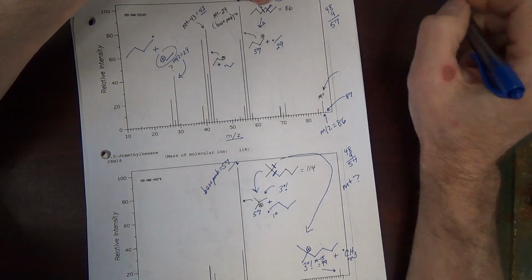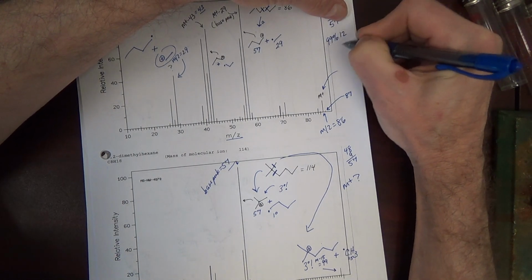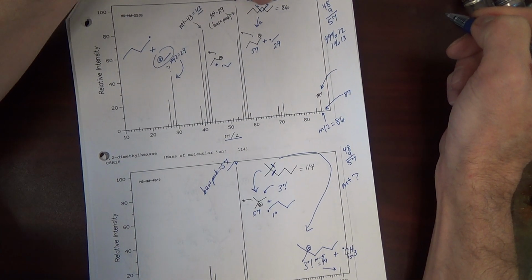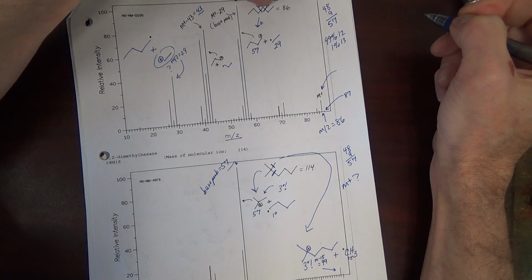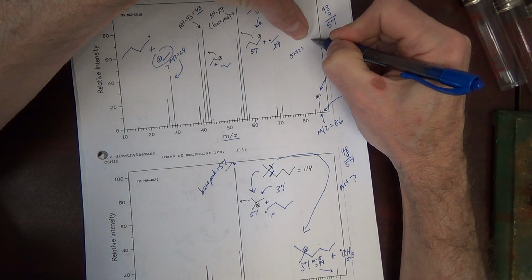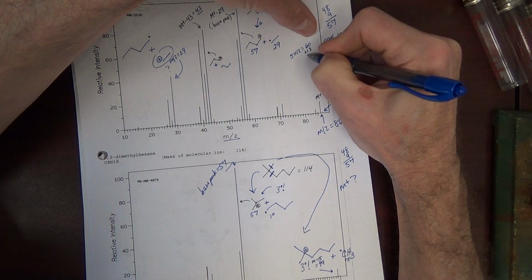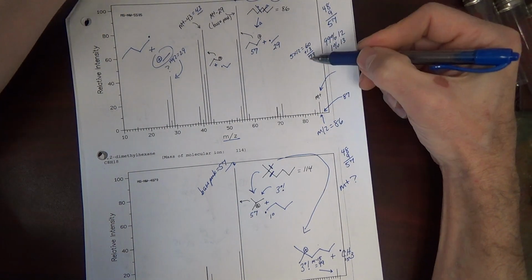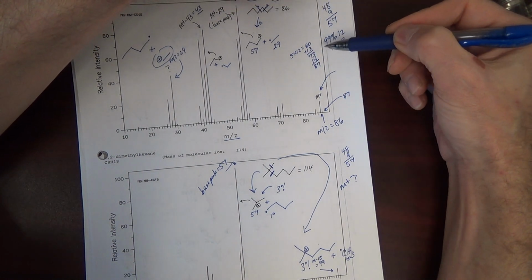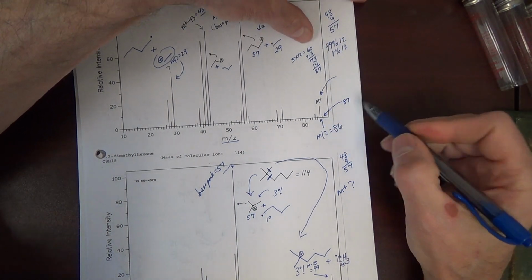That's actually possible naturally, because carbon is, if you remember from day one, 99% 12, but about 1% are C13. So there's a chance of one of these carbons being C13. If 5 of them are 12, 5 times 12 equals 60. And then 1 was 13. That would give your carbons adding up to 73. Then we have 14 hydrogens, and that would give us a total of 87. So, if one of the carbons was a carbon-13, we would get a peak here, and indeed we are. Very small amount.